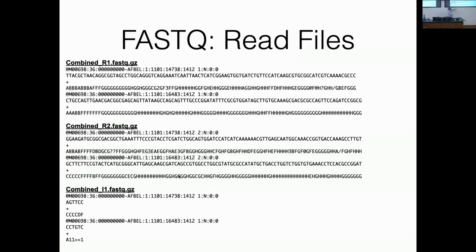Remember I told you that when the flow cell is being imaged, it's captured like a photograph, and then the confocal microscope scans over and takes another picture, and scans and takes another picture.